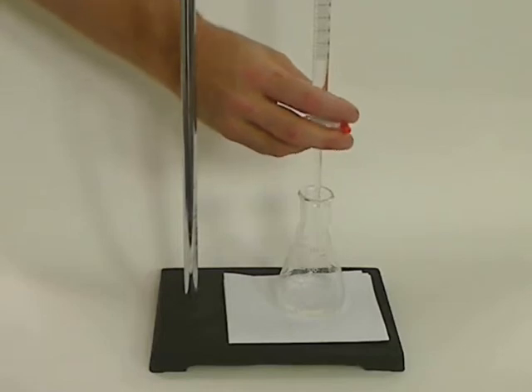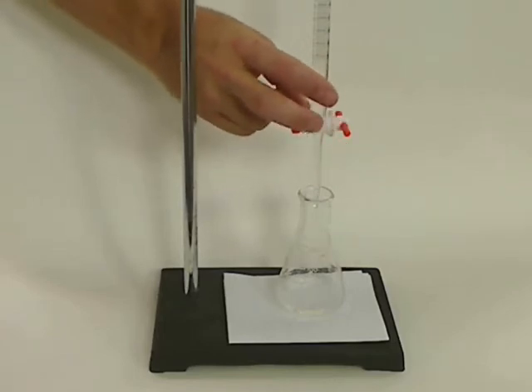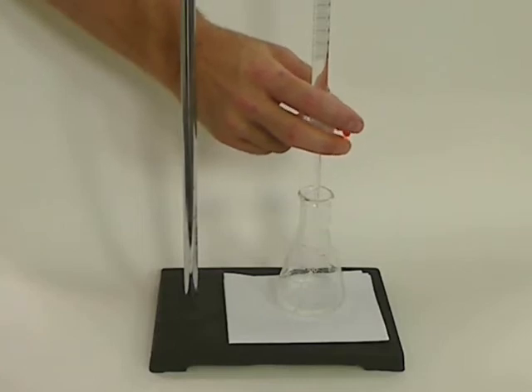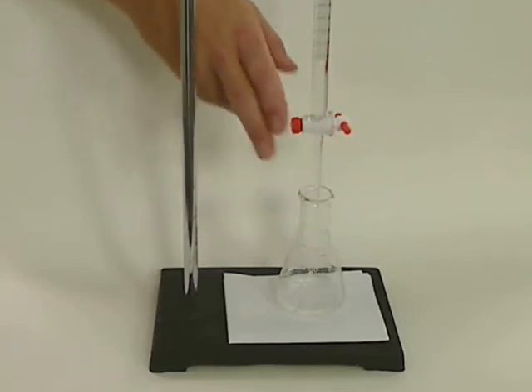The proper technique is to grasp the whole stopcock and turn it like this. This goes back to the old days when we had glass stopcocks and glass barrels that were greased on and very easy to pull out. So we used to do it this way so that we wouldn't pull out the stopcock during the titration.